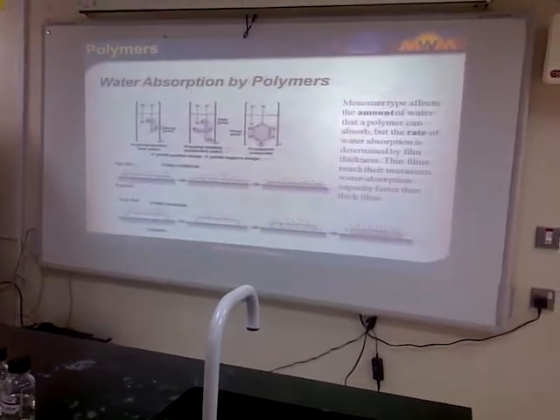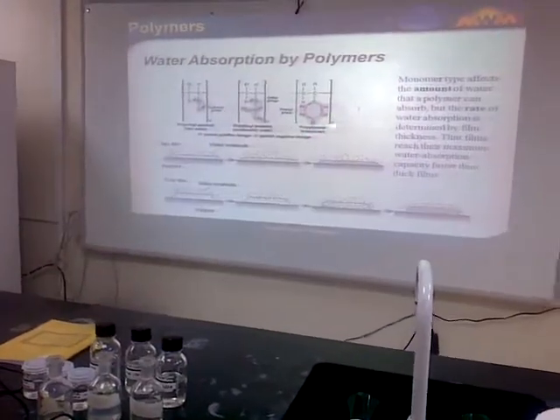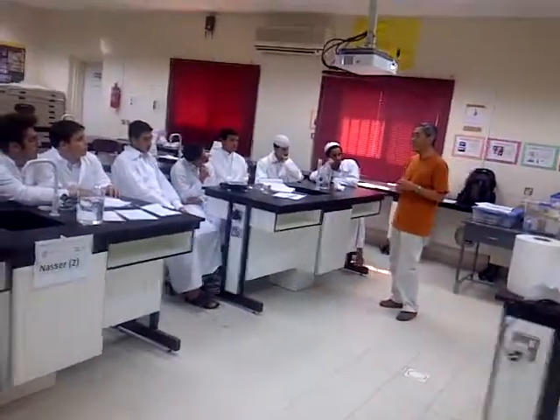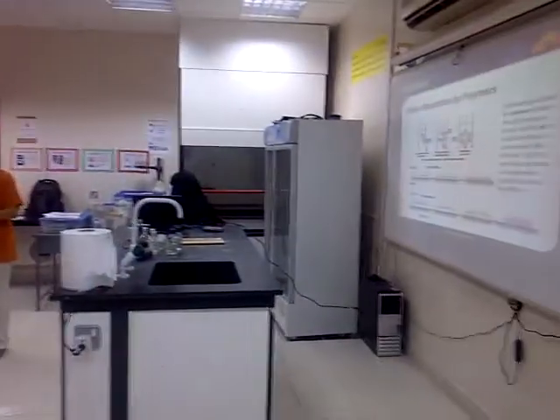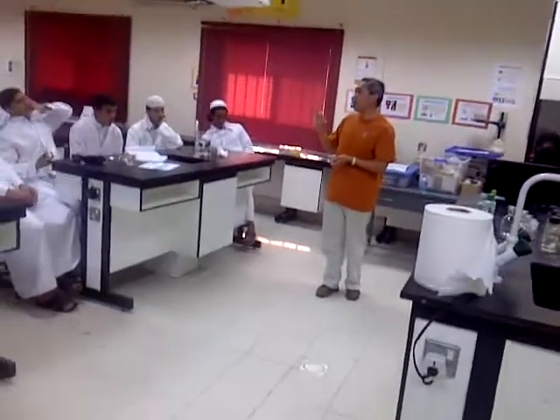So let's conclude this activity. Okay. So we know that polystyrene is non-polar. So we were talking that it should not absorb anything, right? If you did absorb something, what do you think could account for that? If in your experimental measurement you found that polystyrene did have some water absorption, what could you conclude? Maybe you didn't dry it properly? Yeah, maybe you didn't dry it properly. Sometimes you may have water trapped between the film and the glass. I think that's the only way you account for the increase in water. But actually it should have no water absorption.